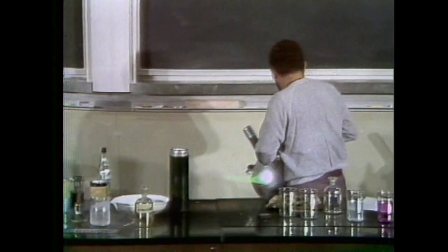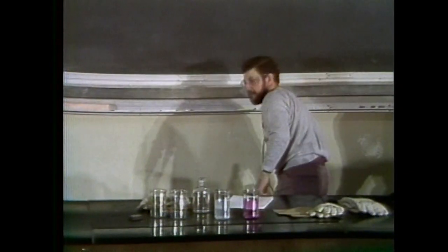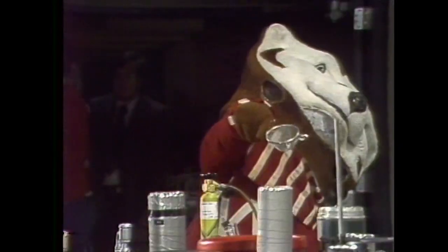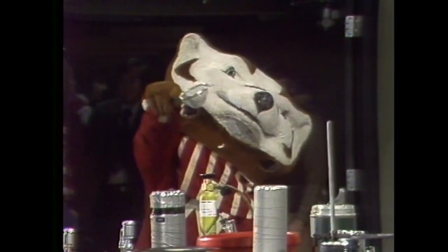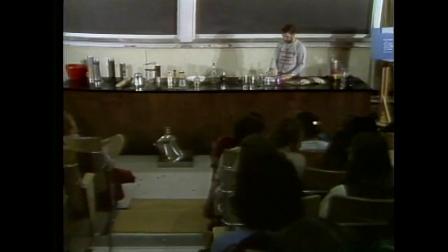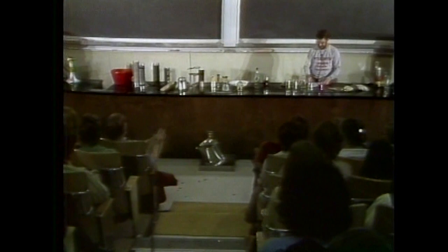You're not grading me on my technique, Bucky, are you? You are. What I'd like to show you, Bucky, is the effect of. Wow, that wasn't very nice, Bucky, was it?